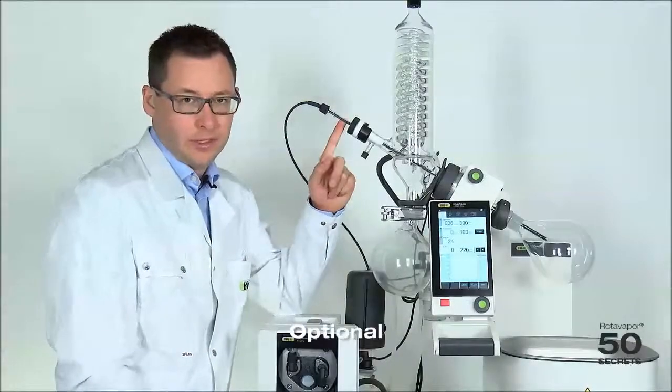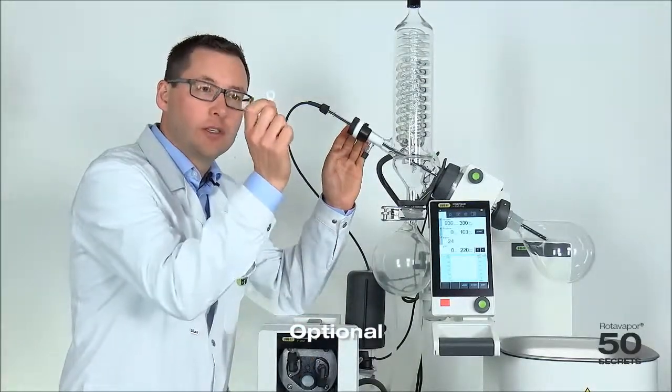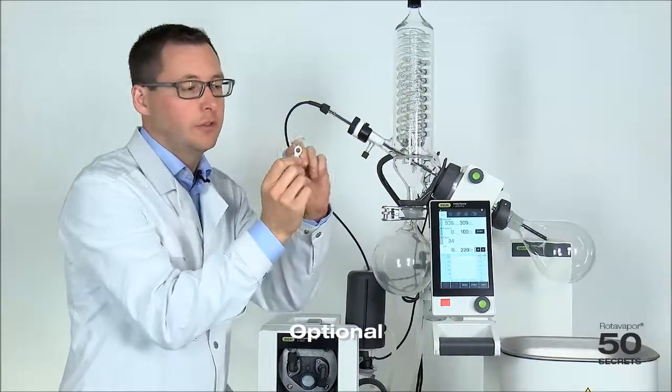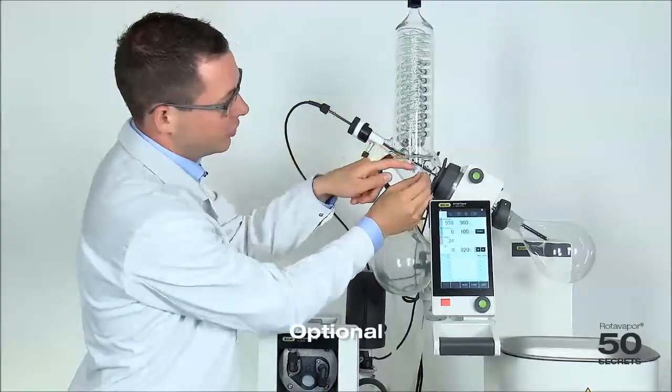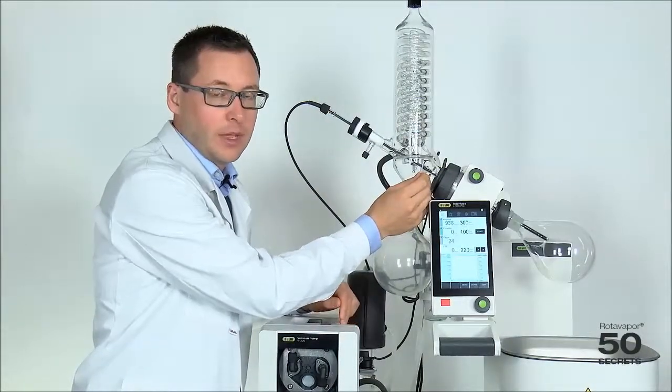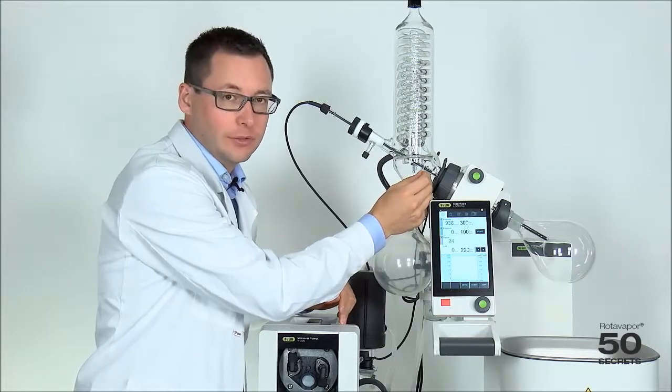Together with the foam sensor, you get delivered with this drain disc. This drain disc is used so that the droplets which form on the foam sensor don't go back into the evaporating flask. I would like to show you how to mount this.